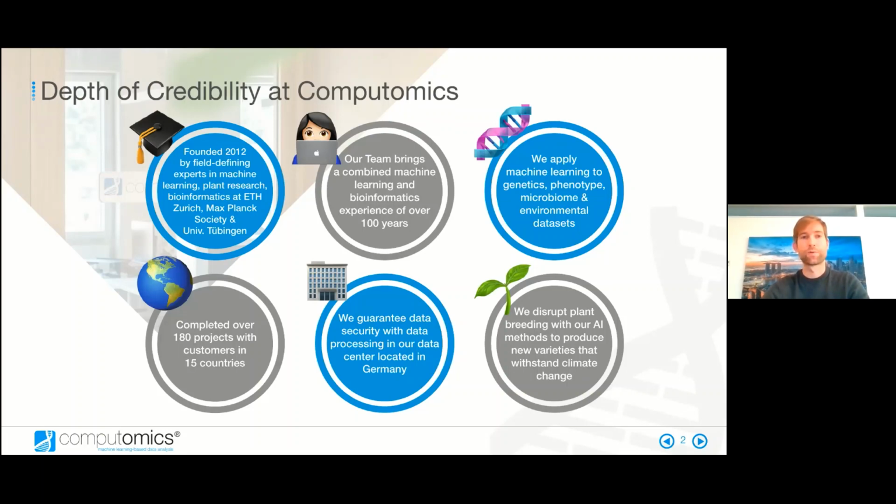And we focus also on pangenomics, the study of multiple sequenced genomes to each other to explore the global genetic variation within a species or population. Overall, these fields align well with our skills: machine learning, plant research, and bioinformatics, and help mainly plant breeders to improve their programs.